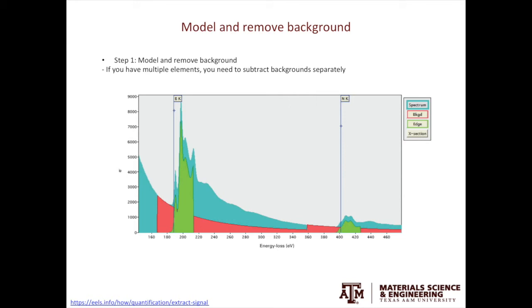The example here is boron nitride. It is intuitive to do the background removal for boron, but for nitrogen you have to do a separate background removal.